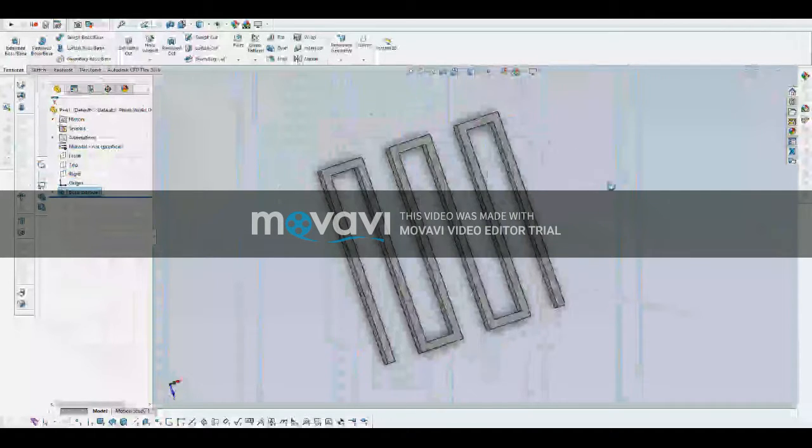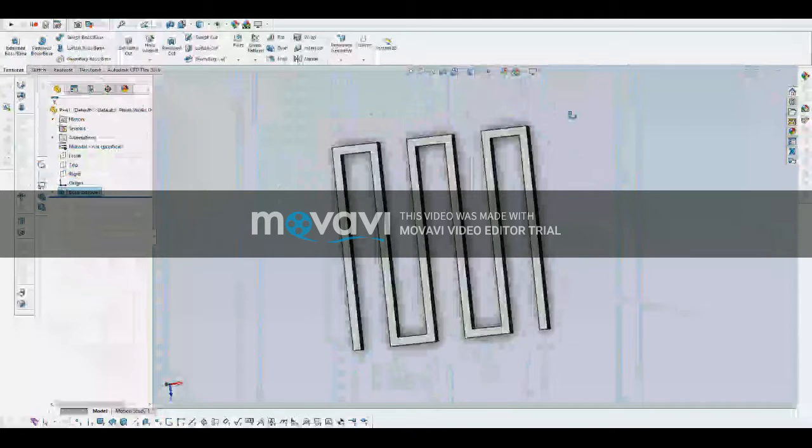Now you have completed the design of your first layer. Save the design as a solid part.